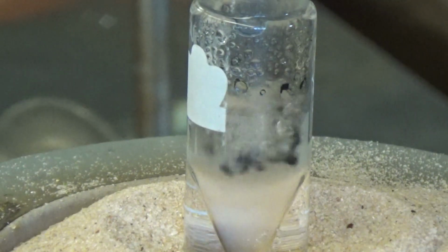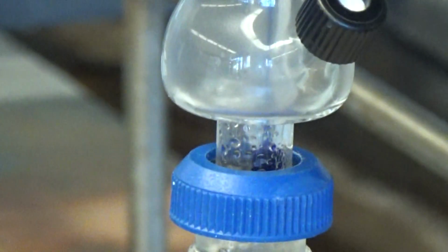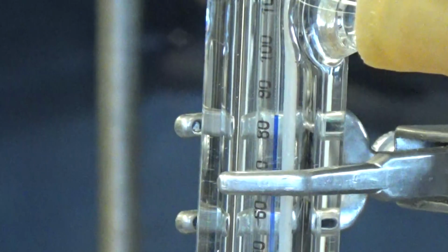Yeah, some is coming. It looks like there's a little bit of liquid there now. It's coming. There's more coming. Temperature is about 85 now. I said to go to 100, right? About 100 or so, yeah.